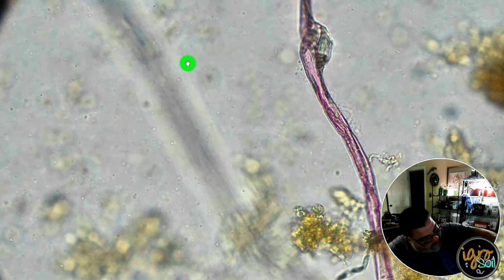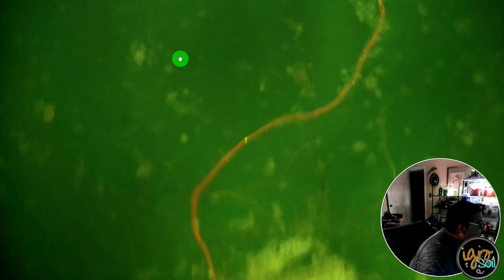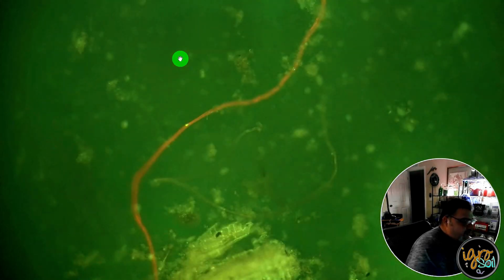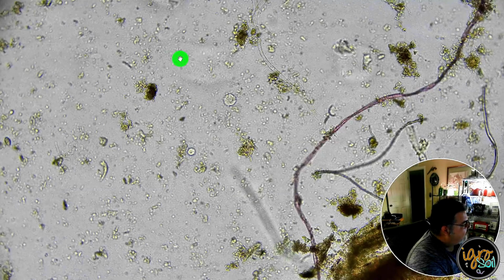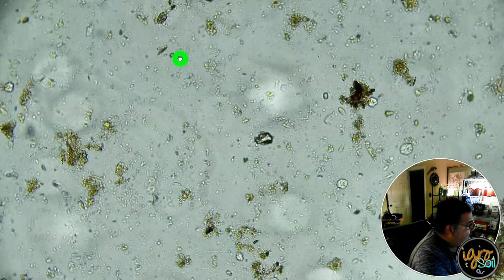But the epifluorescent is gonna light it up. There's no question about it. That is like an orangish red piece of plastic, and it's big. So unless there was like a bag or whatever it was, it's a large piece of microplastic. And unfortunately, we're seeing more and more of this stuff. So we're kind of going in on this and just trying to figure out if microbes eat it. There's a lot of research on that, but that's for another video.